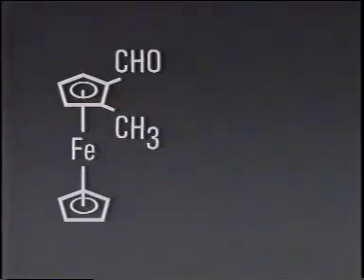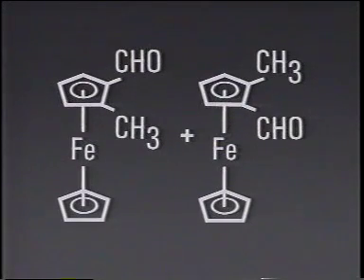Let's illustrate another use for NMR spectroscopy. Imagine that you've synthesized a chiral compound of which only one enantiomer is of use to you, say this compound. The NMR spectra of these and all pairs of enantiomers are identical, and hence can't be used to find out the relative amounts of the two enantiomers.